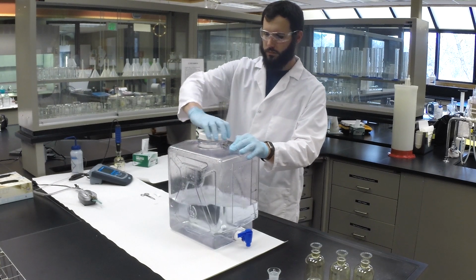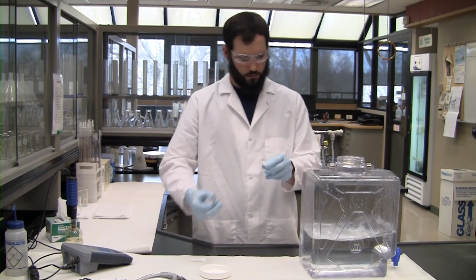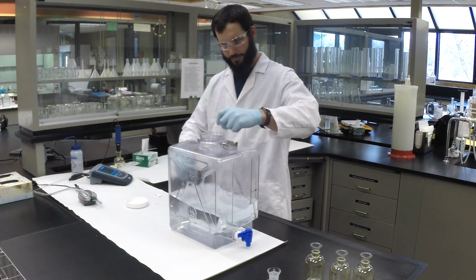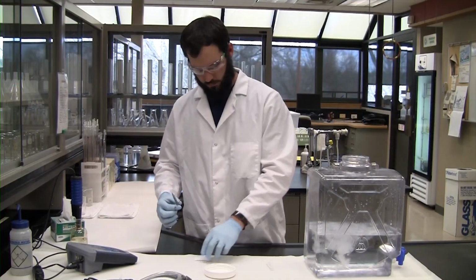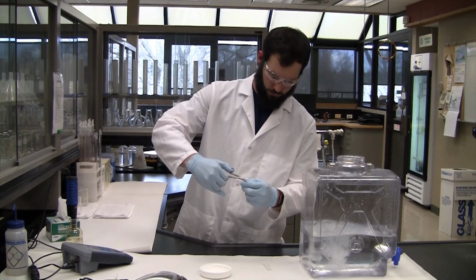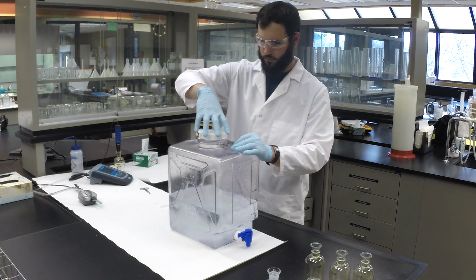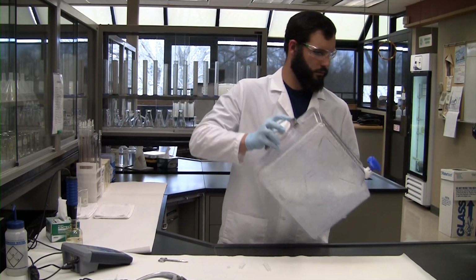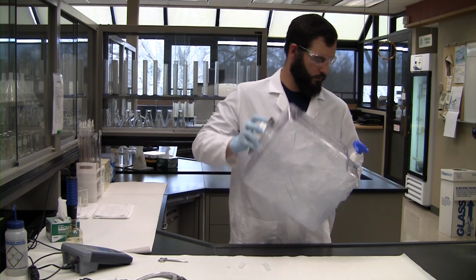Nutrient pillow packets. After aerating the dilution water, add the nutrient pillow packets just prior to analysis. Add as many packets as needed based on the volume of water you are using. Once the packets have been added, cap the carboy and shake it vigorously for 10 to 30 seconds. We add nutrients to the dilution water as a food source for the bugs.